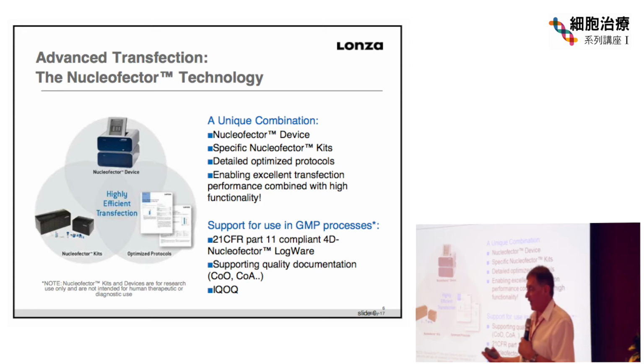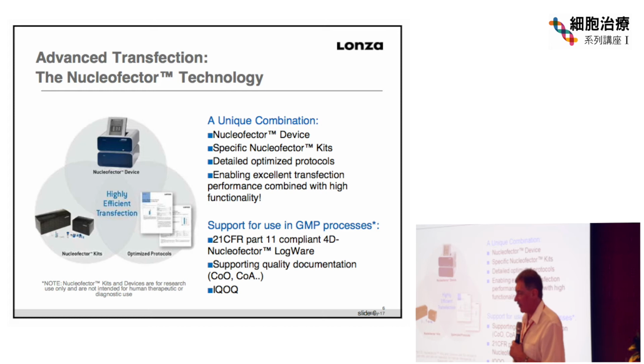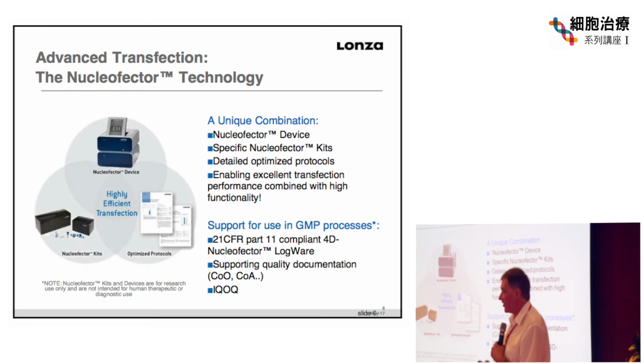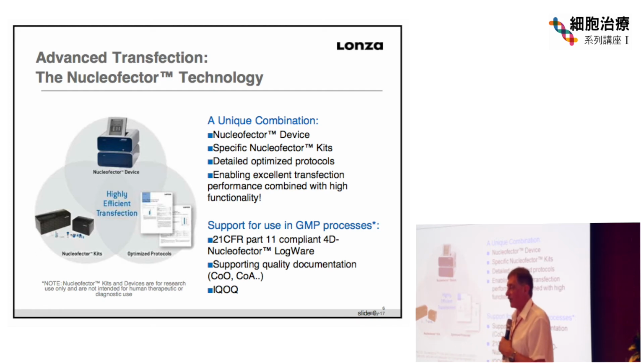So in support of this, it turns out the more that this is looked at, there's not a lot of guidance out there from the FDA on GMP manufacture of something like the nucleofector device. It is looking more and more like an accessory device, and there's a different regulatory burden on an accessory. And so what we have right now is supporting quality documentation, advanced documentation on our plastic electrode, which is the only part that is in contact with the cells. So leachability analyses, we can look at sterility and presence of endotoxin and a variety of other things involved in the manufacturing of this in support of using this in clinical trials.